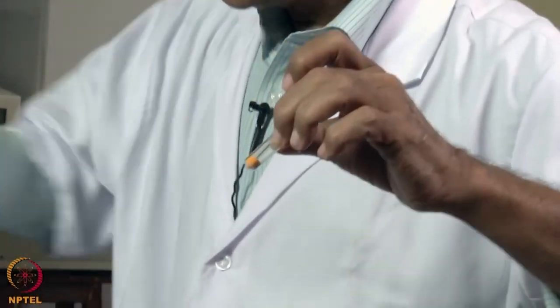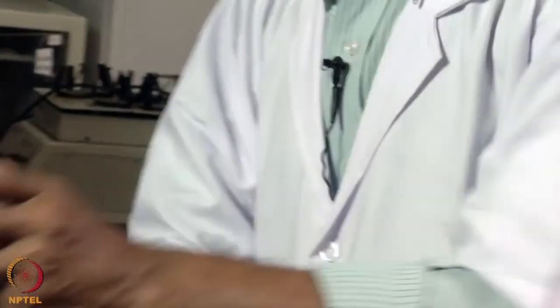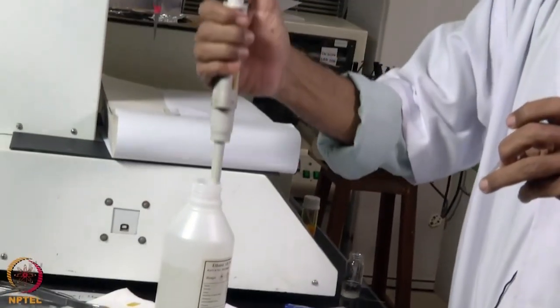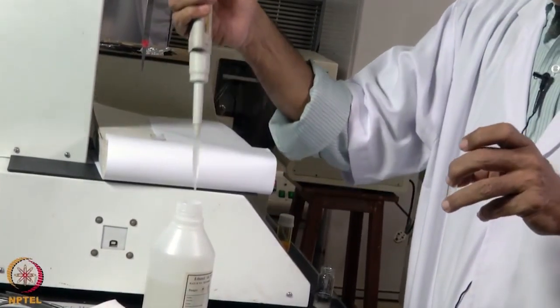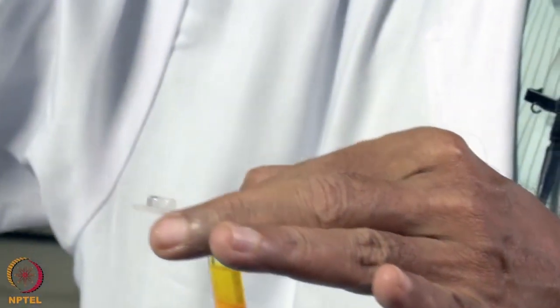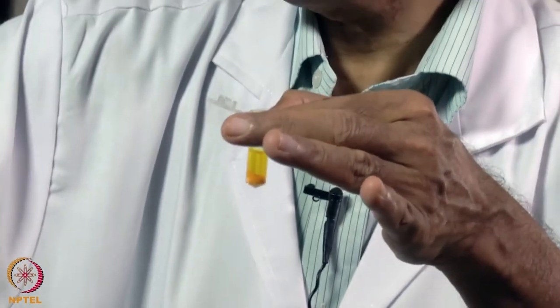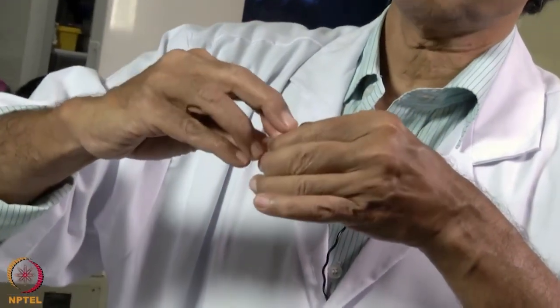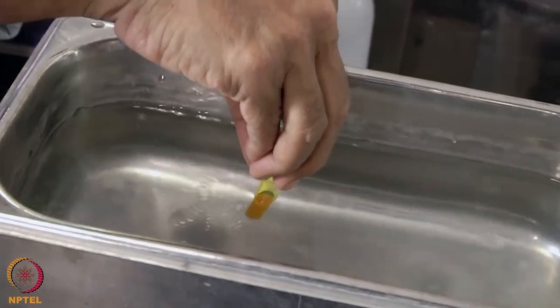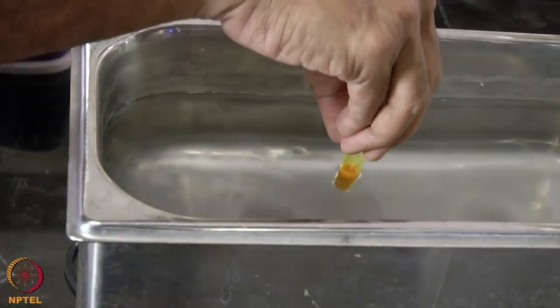We take 200 milligrams of curcumin. Curcumin is not water soluble, so we need to dissolve it in ethanol — we add 1 ml of ethanol. Curcumin has to be dissolved and dispersed in ethanol, so we use a water bath sonicator to mix it thoroughly.